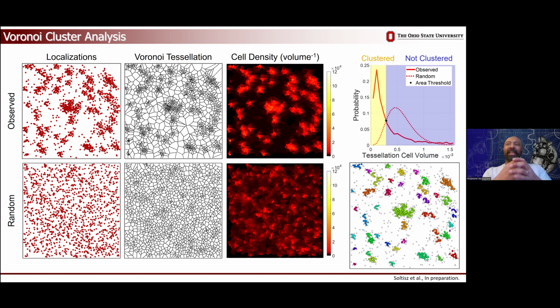In other words, the size of these cells is an inverse metric of how densely these points are packed together, right? If points are densely packed, they each claim a very small cell. If points are in loose, empty space, those points get to claim big, wide open cells. So we can then plot the distribution of, in 2D area or in 3D volume or even in higher dimensions, the size of these tessellation cells and get a sense for instantaneous density of these points at each location.